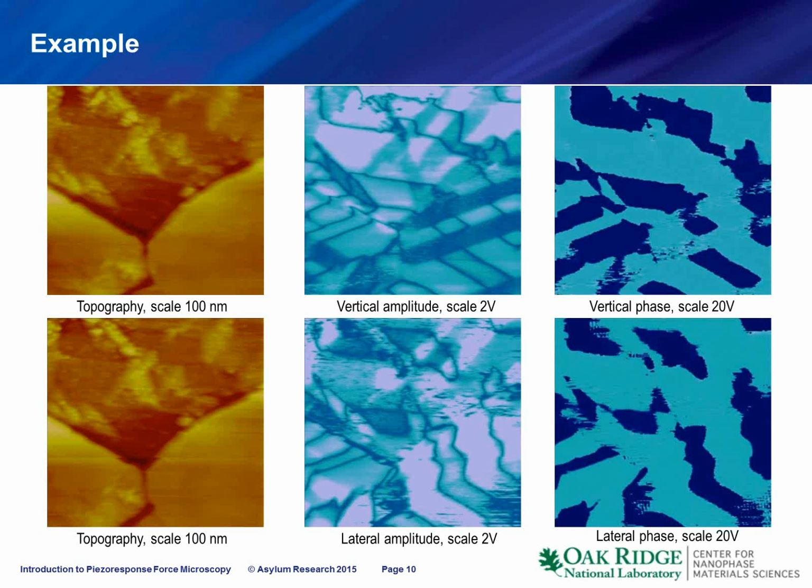So this is a kind of prototypical material for PFM. What you see in the first set of images, the yellow ones, is basically the surface topography. And this is just how the surface looks. Polishing of polycrystalline ceramics typically produces a pattern of grains polished at different rates. So you see several grains on this image.